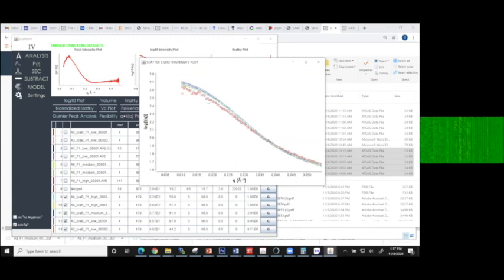It could be that as a function of concentration, there's more complexation going on, or less complexation, or maybe the whole structure is getting a little compressed. These are really good things to know about the solution state of your protein system. This is, again, the living system stuff.